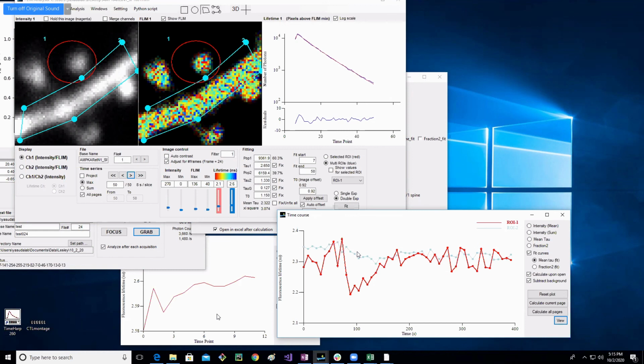Wow, I just saw the time. Yeah, I mean, you end up not using a ton of it. The more you play around, you shouldn't feel worried about touching any of the buttons. It's sort of fun and educational to play around. So I got pretty much most of it.